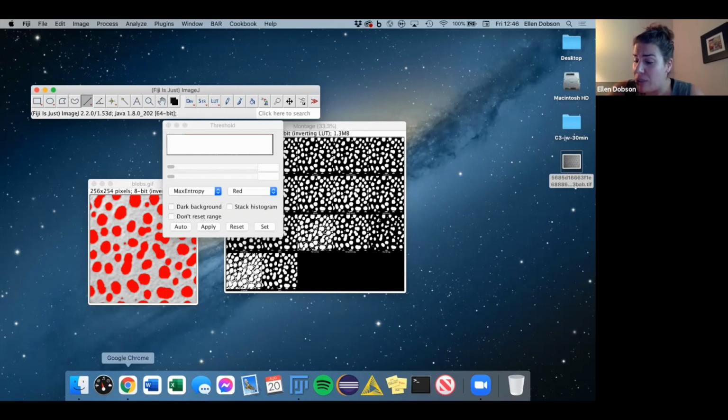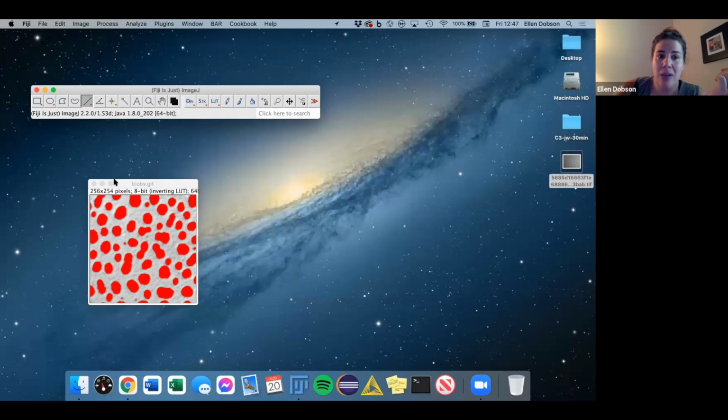So setting thresholds on the same channel as those you wish to measure can hide the variations you could observe. So it's going to affect your outcome, your conclusions. So ideally have a second channel that's steady. For example, if you're looking at a nuclei marker stained with a fluorescent label, then use DAPI to do your segmentation and find your nuclei. And then you can segment your object, and measure that other signal within it.